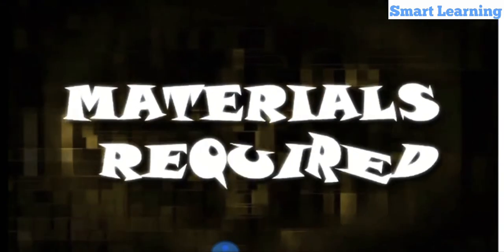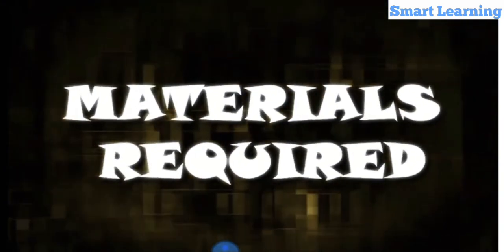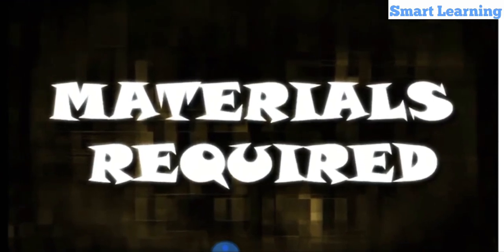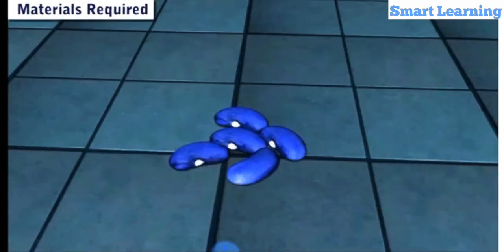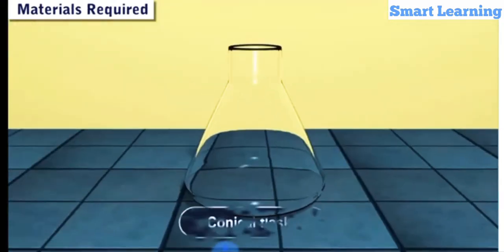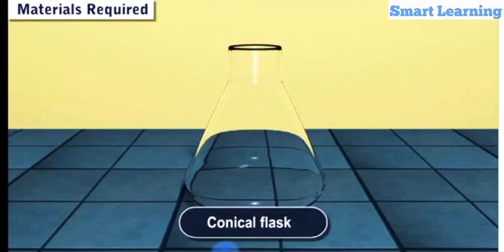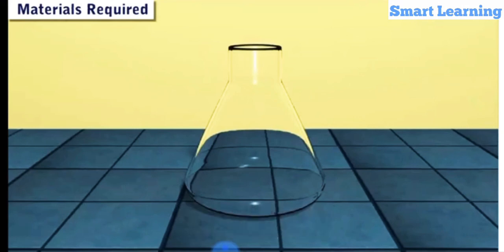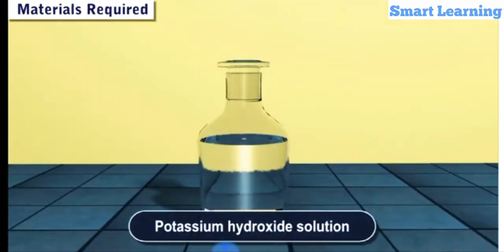Materials required for this experiment: germinating bean seeds, conical flask, potassium hydroxide solution.